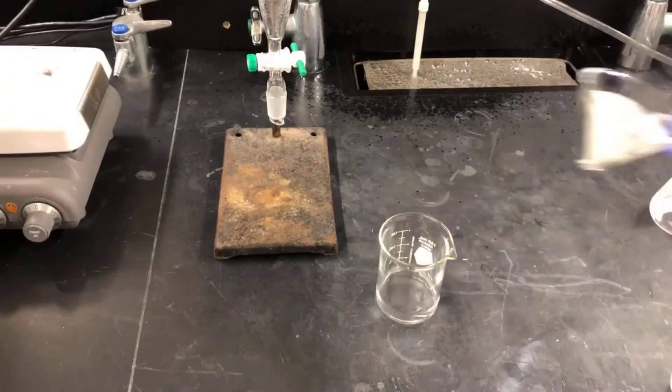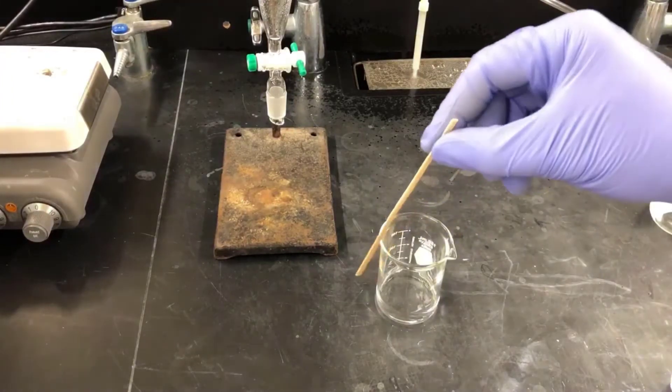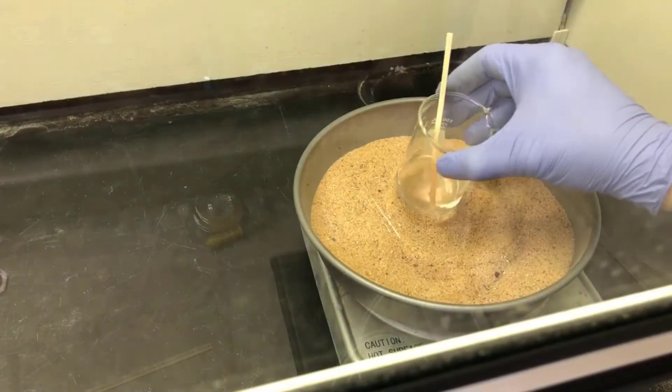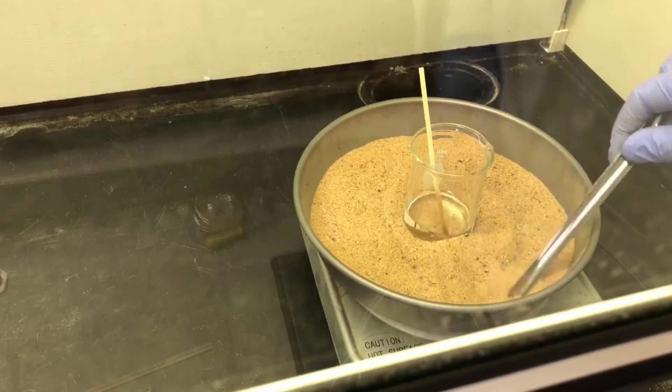Now I can remove and discard the filter paper with the magnesium sulfate, and I'll add a wooden stick to help smooth out the boiling in the next step. The next step is to evaporate the ethyl acetate and isolate solid caffeine. I'll do that by boiling it in a sand bath in the fume hood.